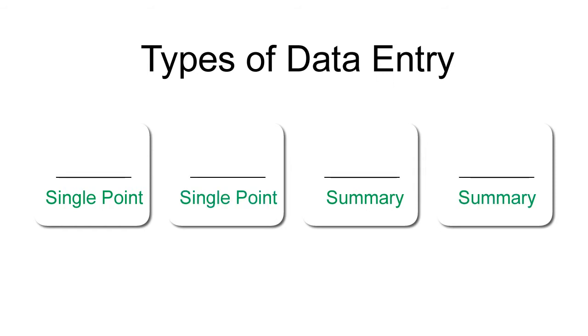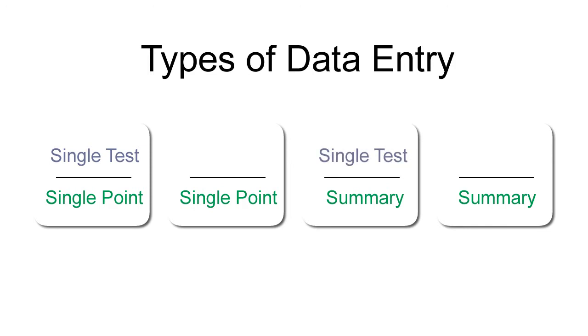Our first type of data entry allows you to enter single point data for a single test, or you can enter summary data for a single test. Some customers prefer a faster method. This allows you to enter single point or summary data for multiple tests at the same time.